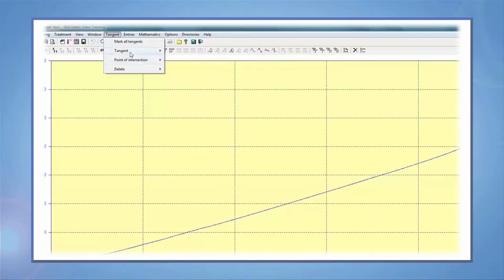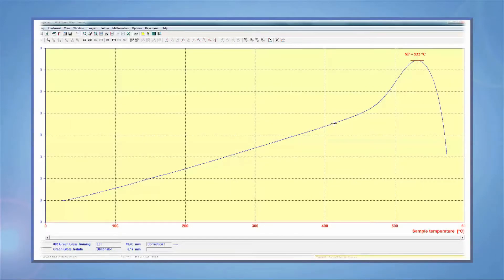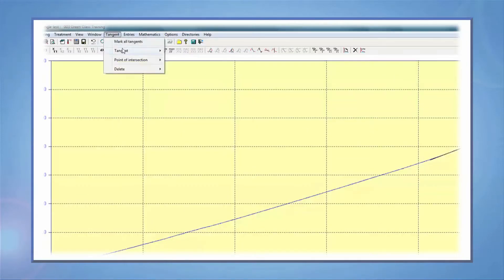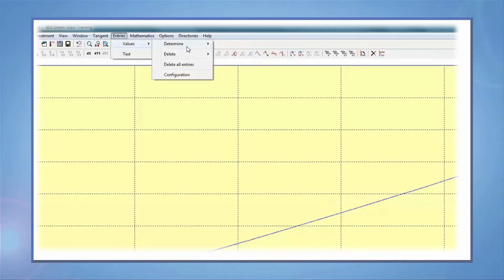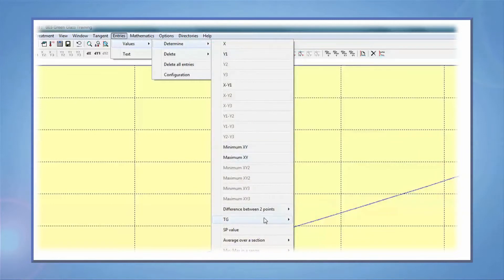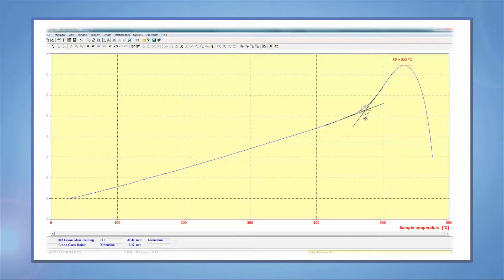To find the glass transition temperature, you will need to draw two tangents. After glass transition temperature, the coefficient of thermal expansion changes, which means there's a slope change. Try to find the linear sections of the curve before and after the slope change and draw two tangents. Then go to entries and select Tg and pick automatic, and the software will find the intersection point of the two tangent lines and label it as glass transition temperature.